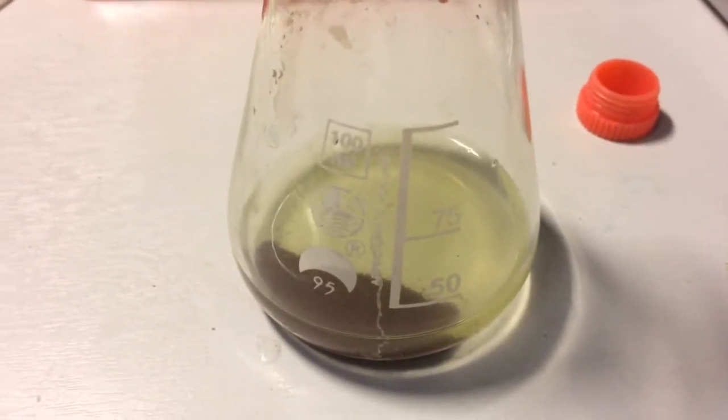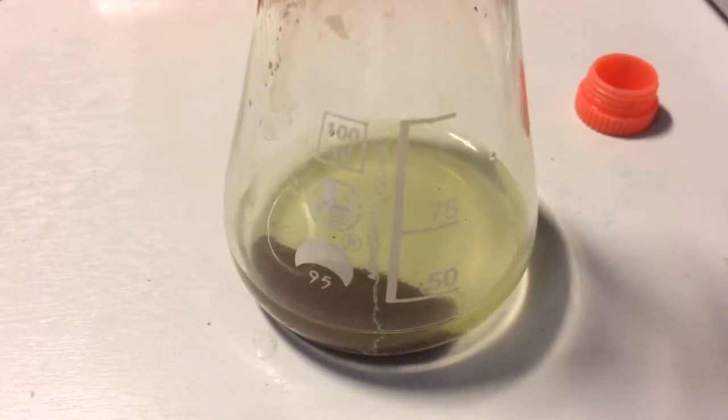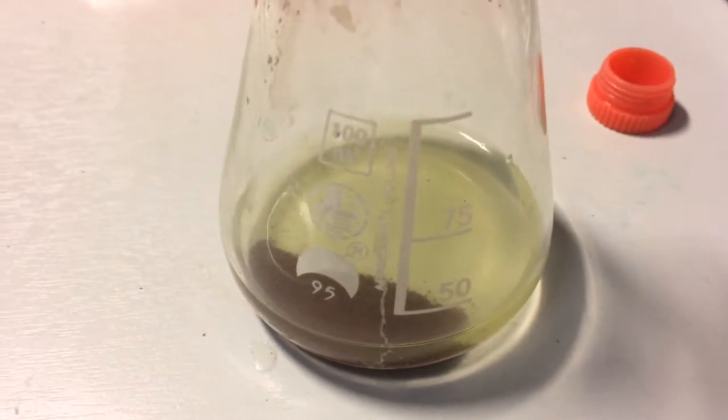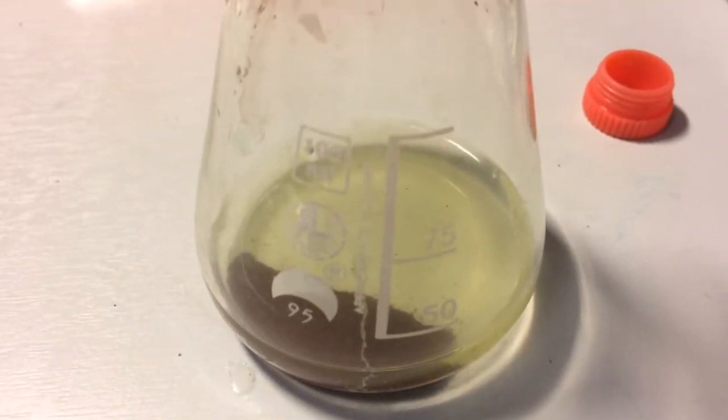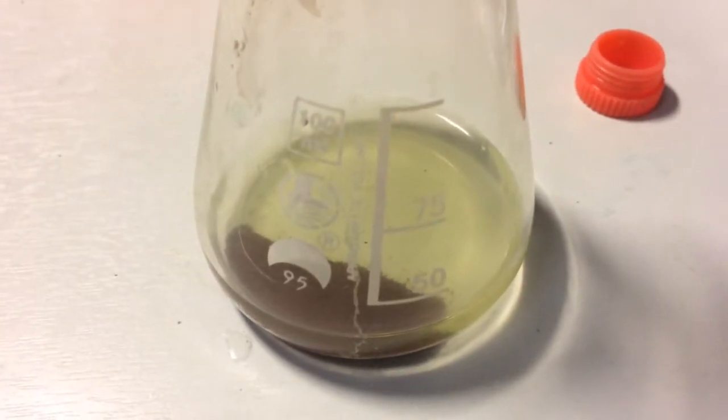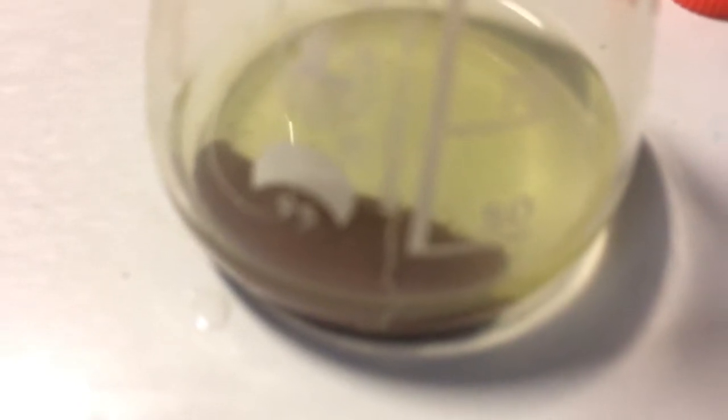After a while, the reaction is complete. You can now see that the original blue solution is now greenish yellow. This is because the solution is no longer copper sulphate. There is now a different compound, iron sulphate. The grey iron filings are now completely surrounded by copper, giving it a reddish brown appearance.